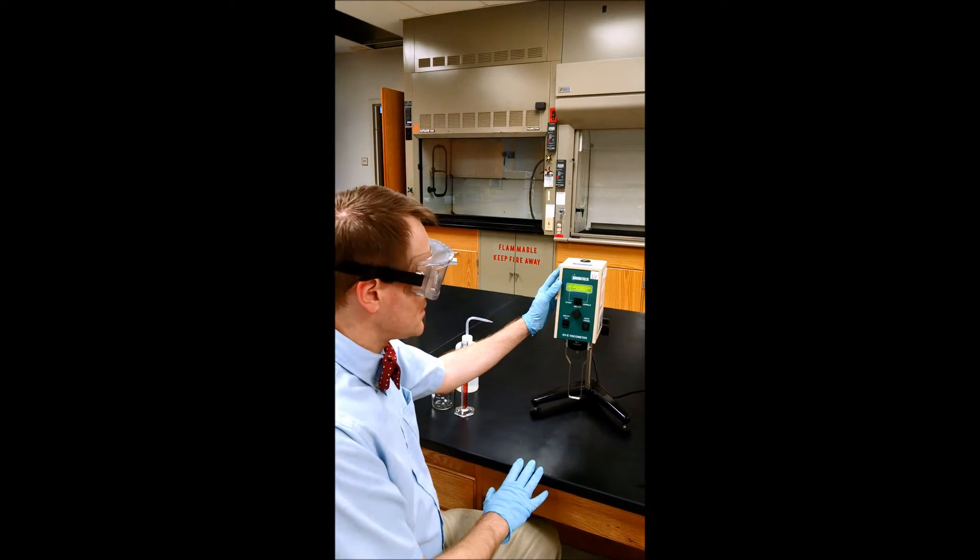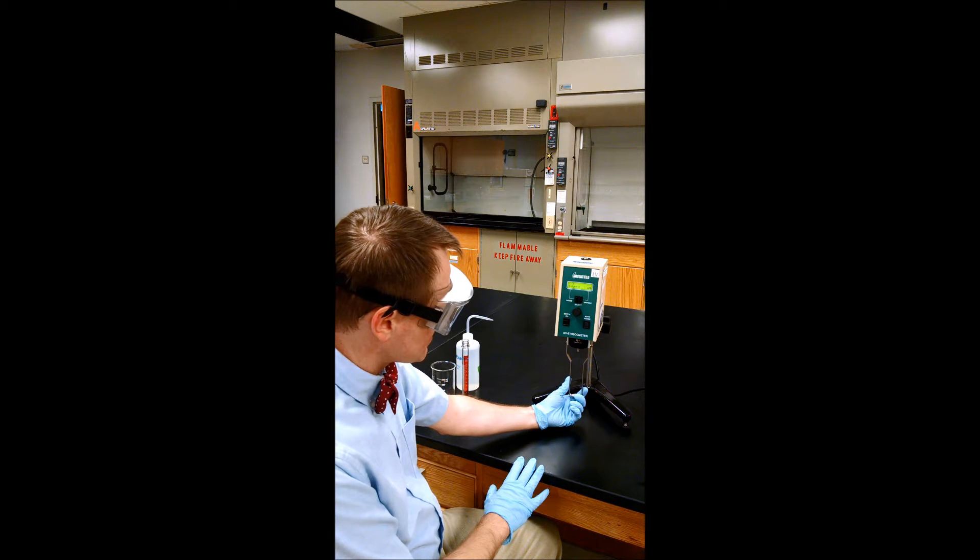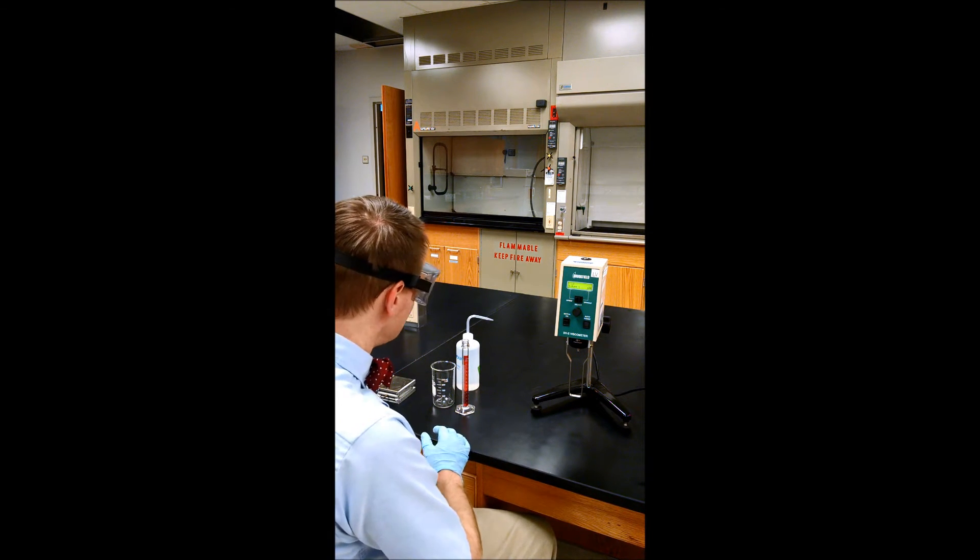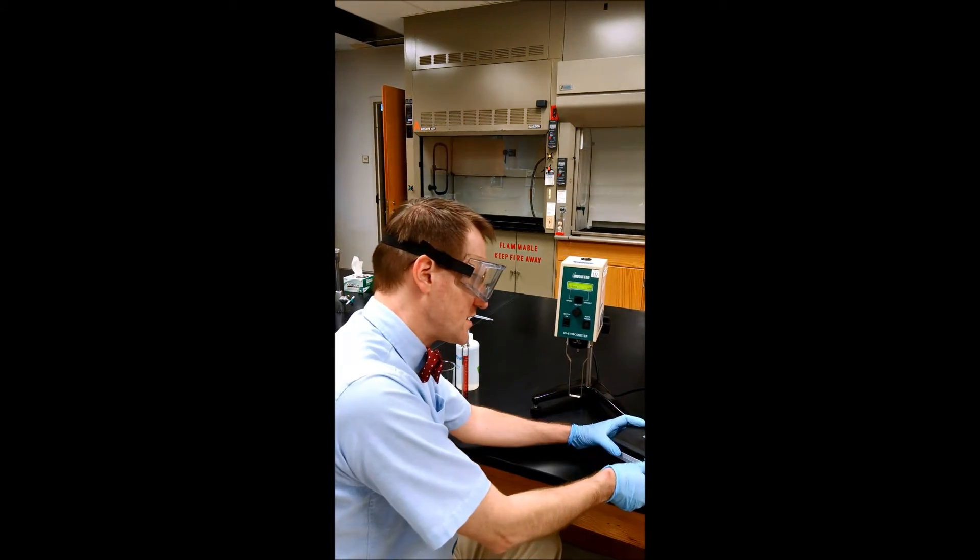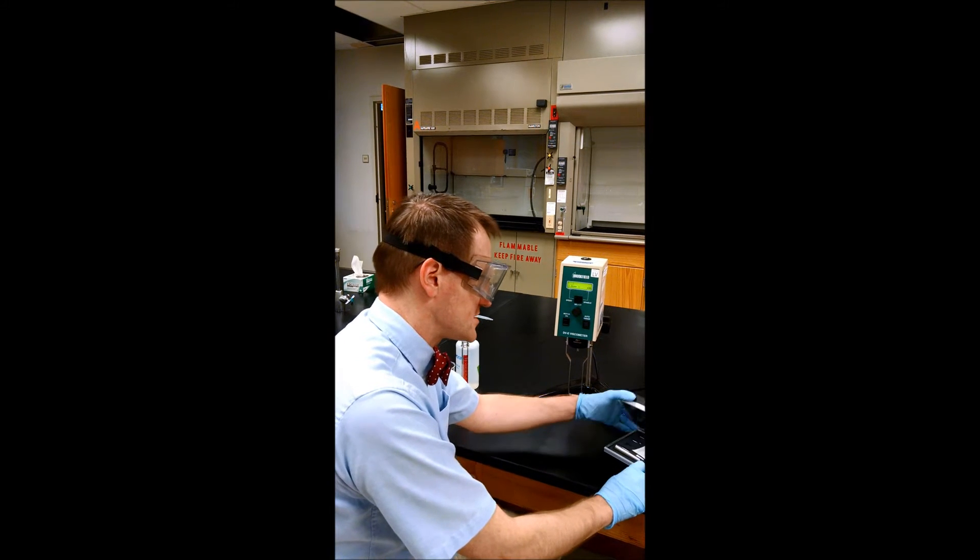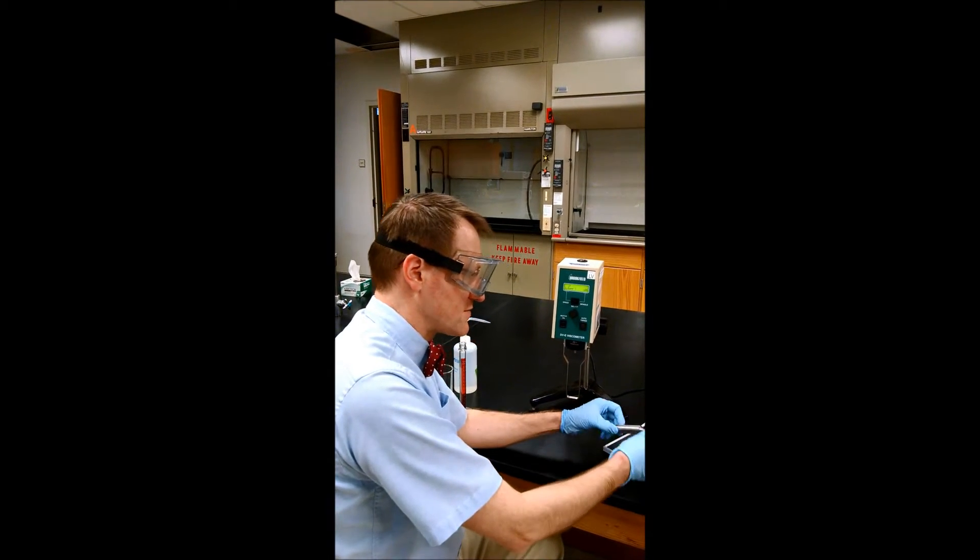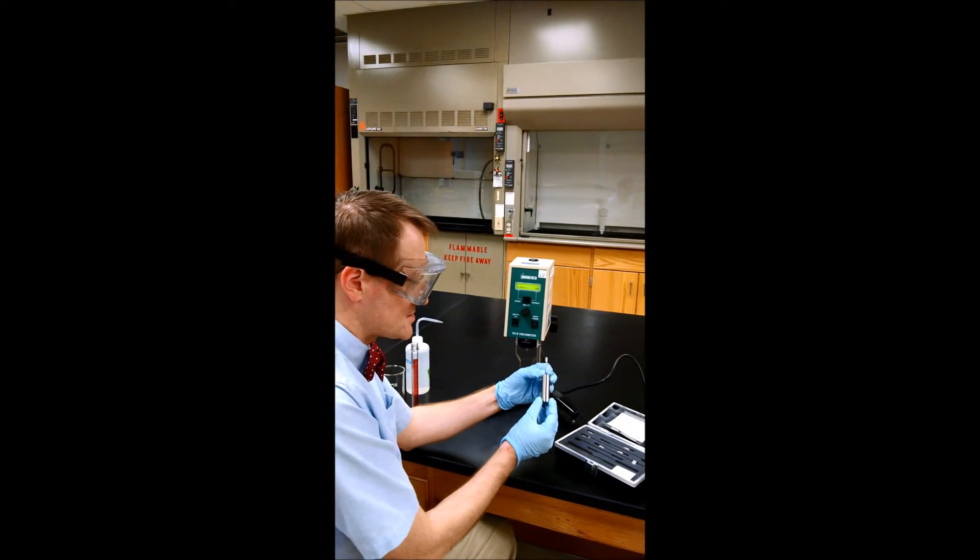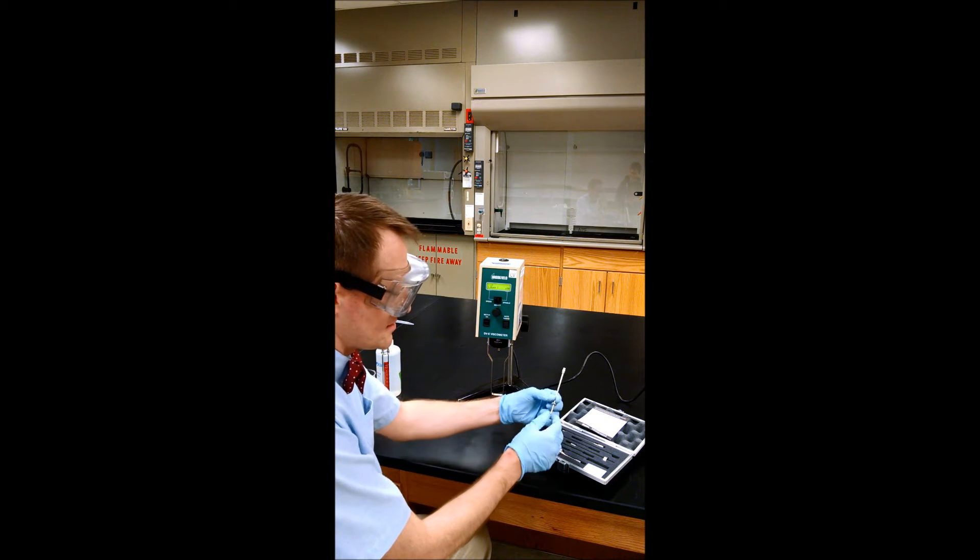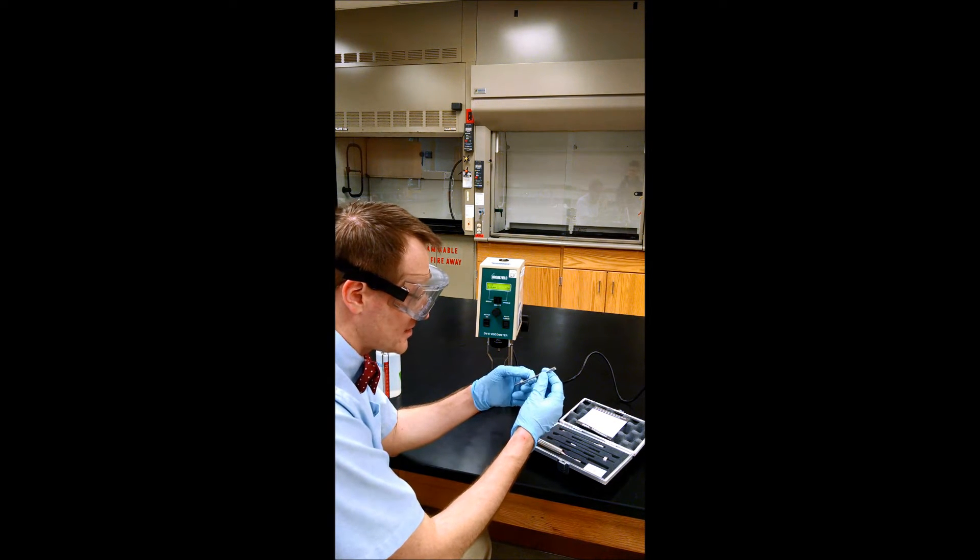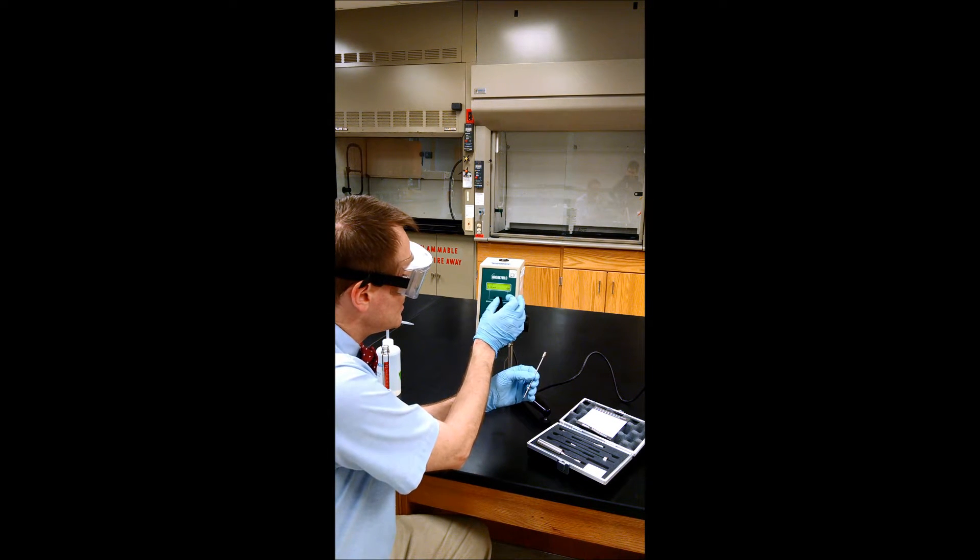In the first part of our lab we're going to use the viscometer in this setup with a spindle guard attached. We need to choose the appropriate size spindle for our material. There's a table in your handout that says which spindle to use for which type of material. You can see we have larger radius spindles, small radius spindles, and disc type spindles.